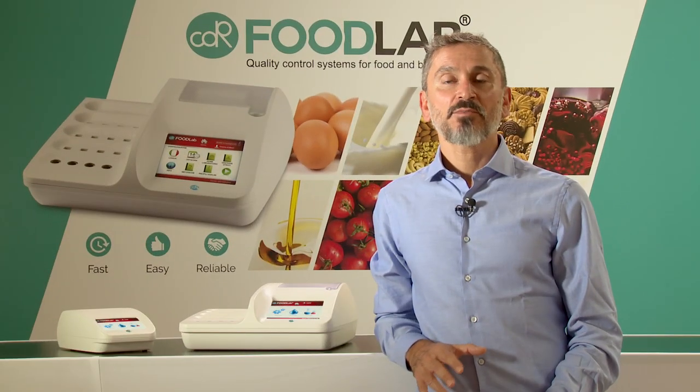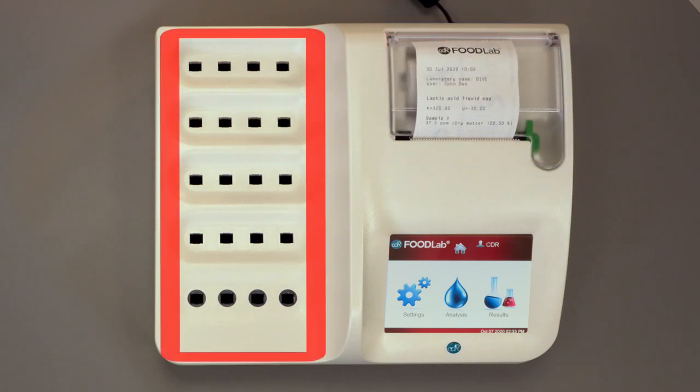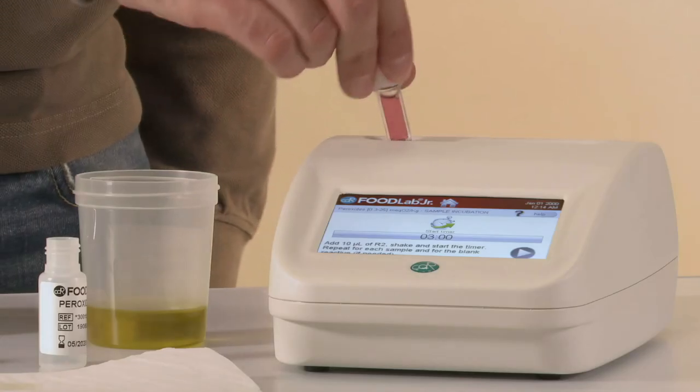We have designed and we manufacture two sets of analyzers. A complete version with printer on board, a big incubation part and ethernet connection. And a junior version, more portable and for customers with low budget.